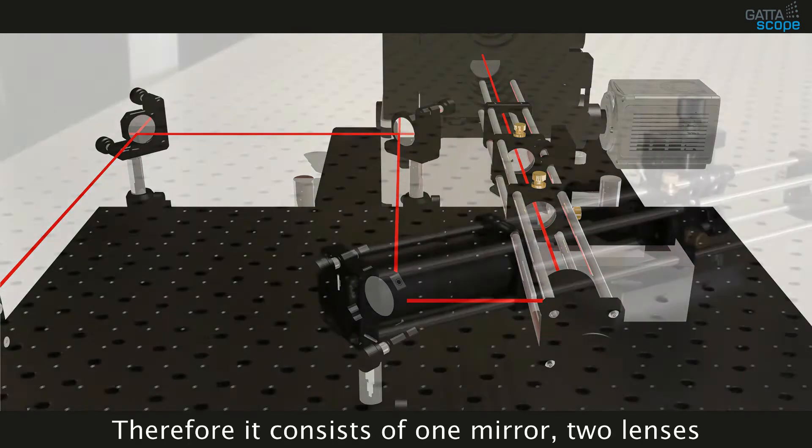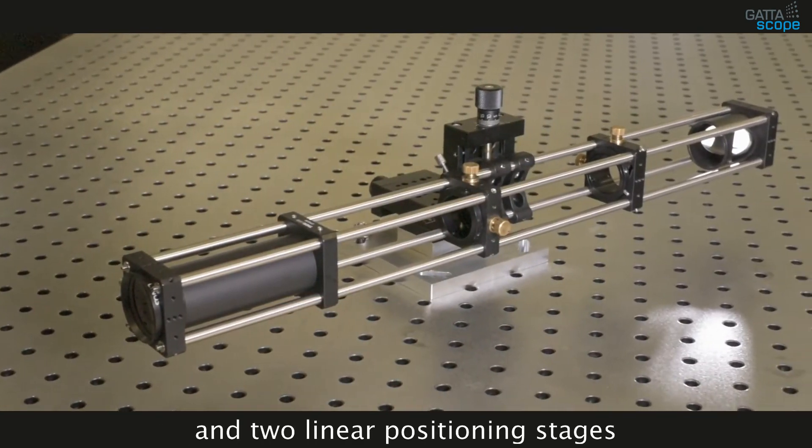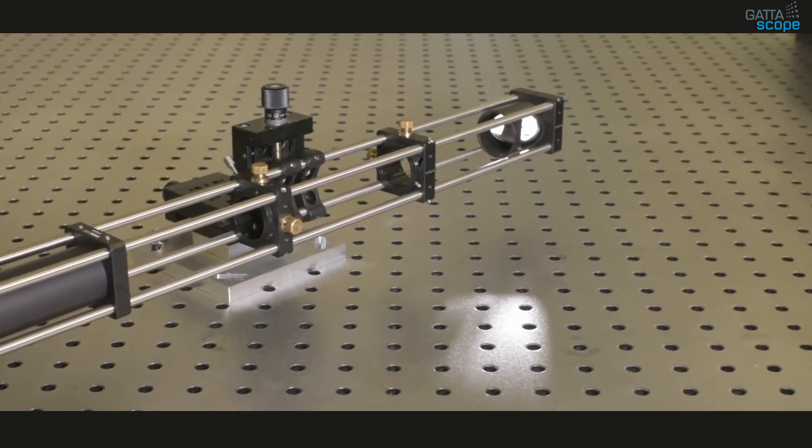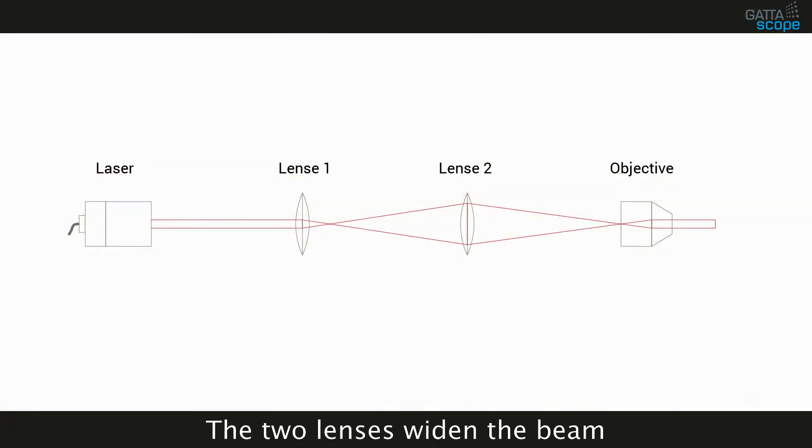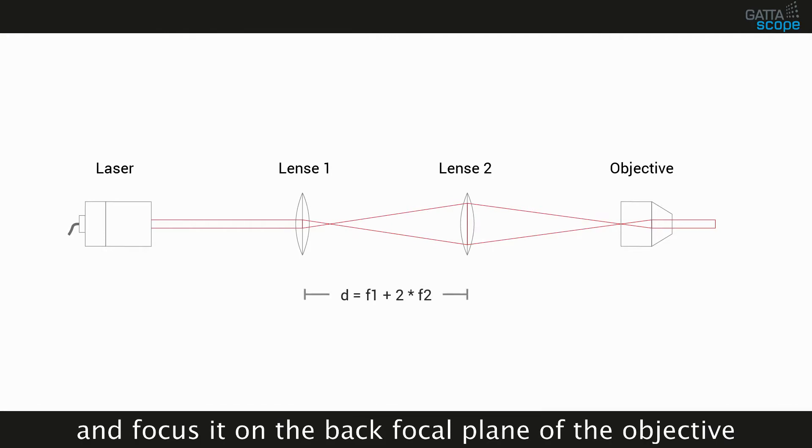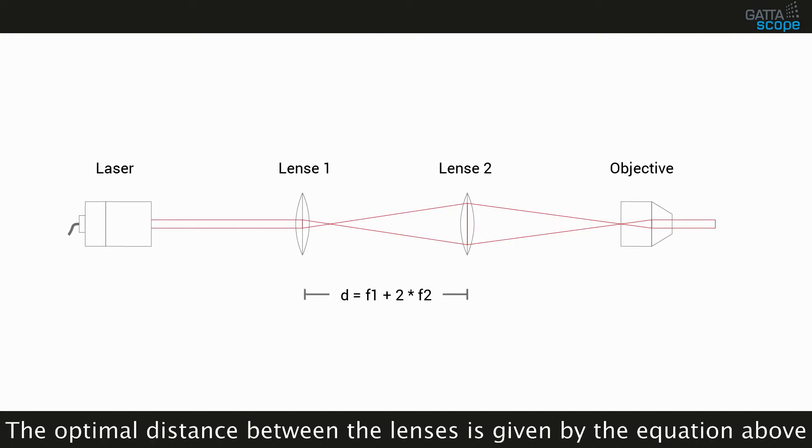Therefore it consists of one mirror, two lenses and two linear positioning stages. The two lenses widen the beam and focus it on the back focal plane of the objective. The optimal distance between the lenses is given by the equation above.